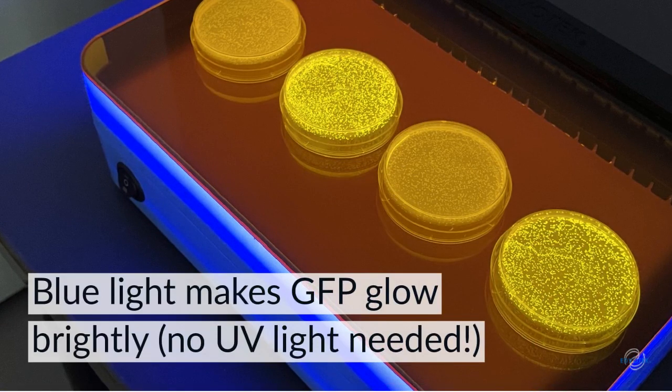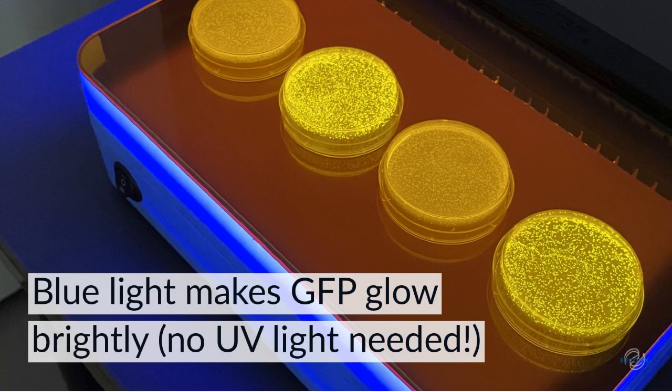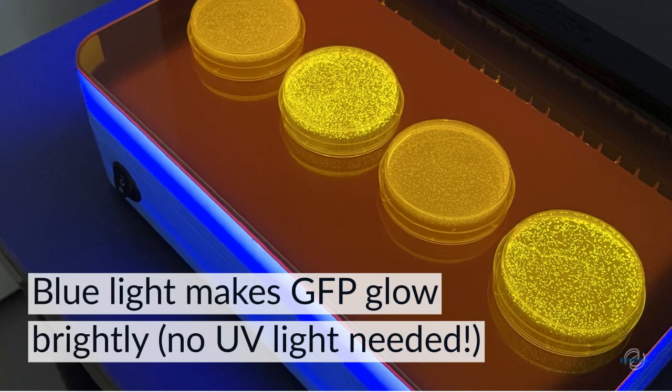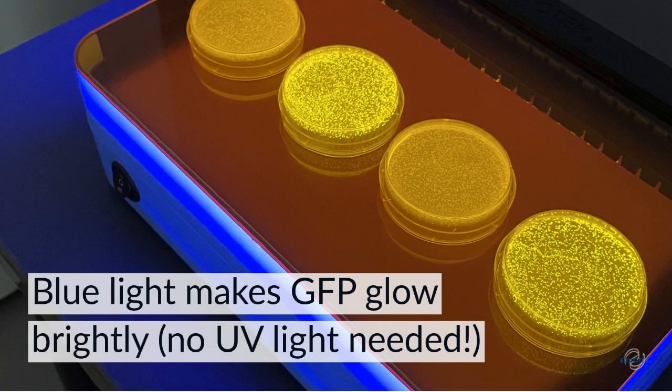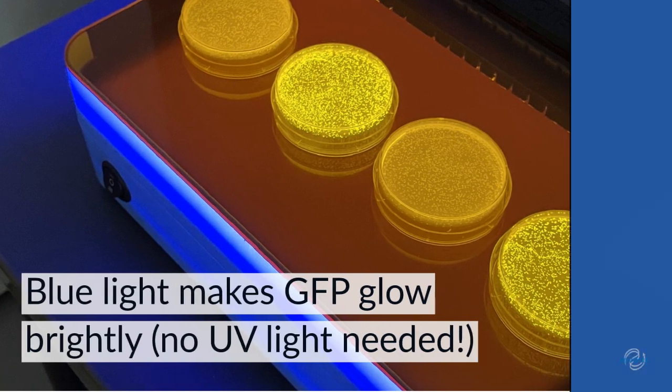Another use of the True Blue 2 Transilluminator is in visualizing the fluorescence of the green fluorescent protein, or GFP. Like CyberSafe, GFP can be excited by blue light. This eliminates the need for UV lights in the classroom.